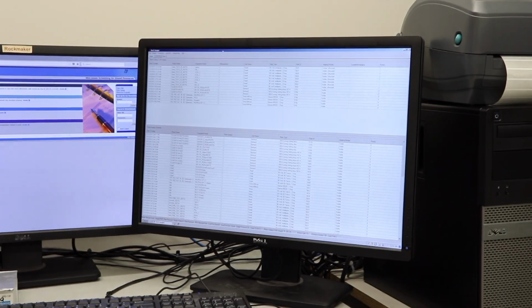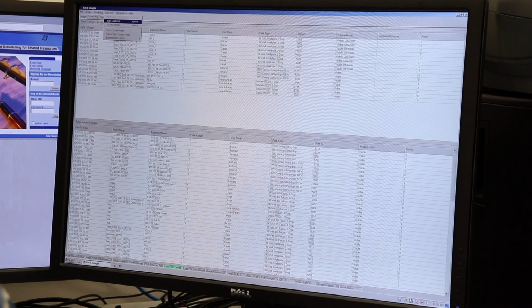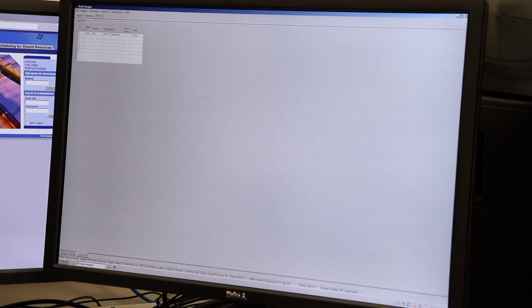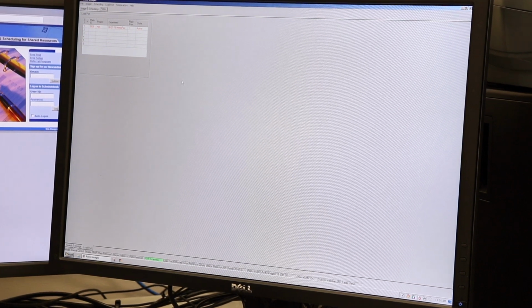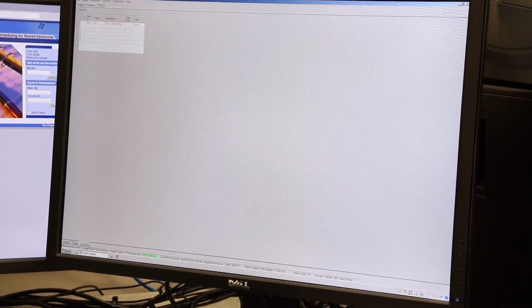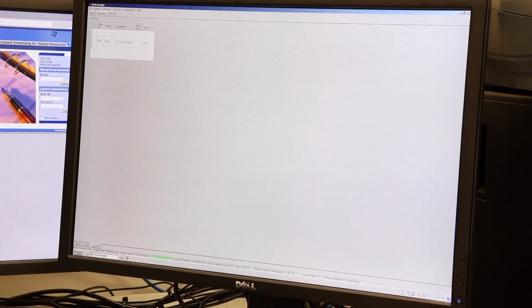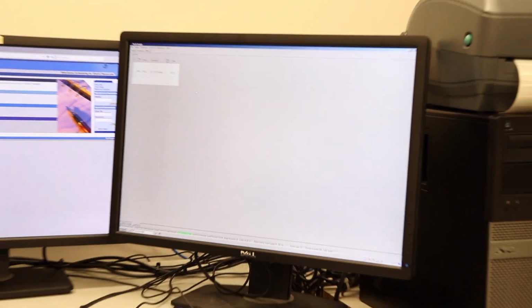So we'll go over to the computer on the right that runs the imager. Go up to load port, scan load port. Right now it's looking at a plate that was in there, but it's not there anymore. Identify that the other plate is no longer in there, and the plate I just put in is. So then we go to load port, store contents. So it's going to come down with the robotic arm, pick up the plate, and move it to storage.